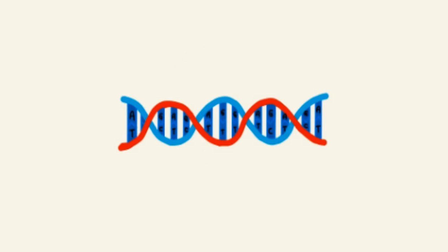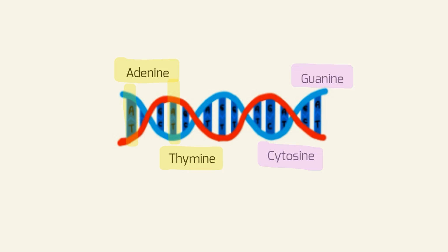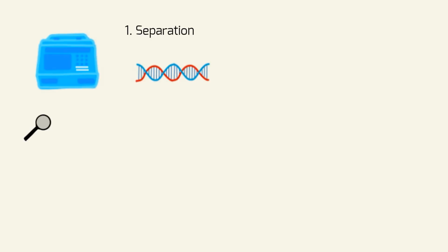DNA consists of two complementary strands built from base pairs. These base pairs being complementary means that every base is only binding to exactly one partner in the opposing strand. Adenine is only binding thymine, cytosine is only interacting with guanine. This being said, the first step of replication, but also of the artificial PCR, includes the separation of this DNA double strand. Both of the forming single strands code for the same genetic information, which is why they can be used as templates for new DNA molecules. The separation is performed by heating the DNA sample, which breaks the bonds between the double strand's base pairs.